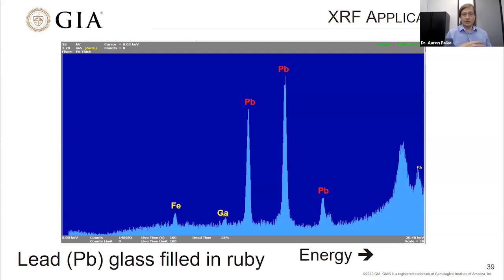And because we've measured these things for tens of years, we know that different atoms within the materials have their own characteristic patterns of X-rays emitted at different energies. So we can basically fingerprint this output from the X-ray fluorescence device, and identify which different elements are in there based on which peaks show up in the data.